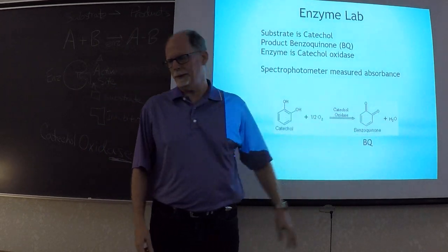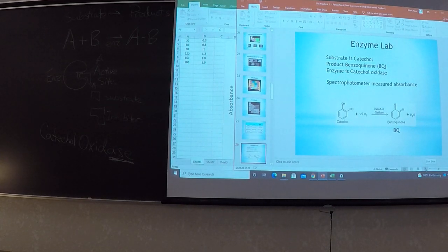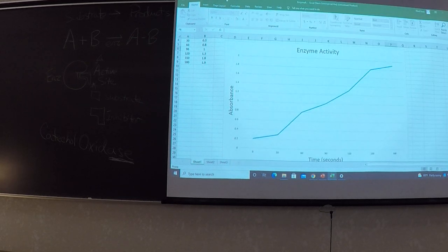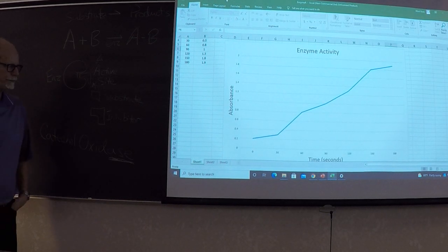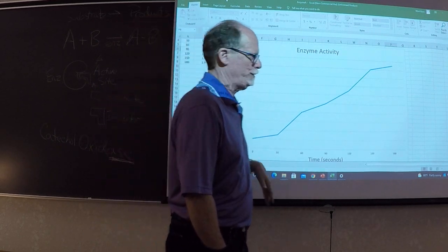Now, to get an idea of what we mean by absorbance, I just want to briefly explain what this refers to.